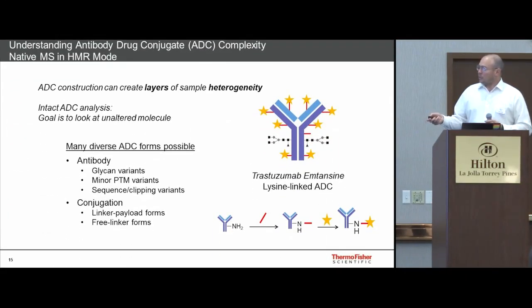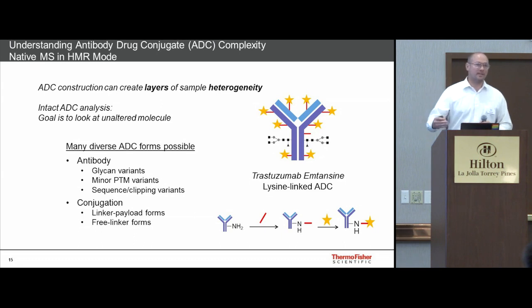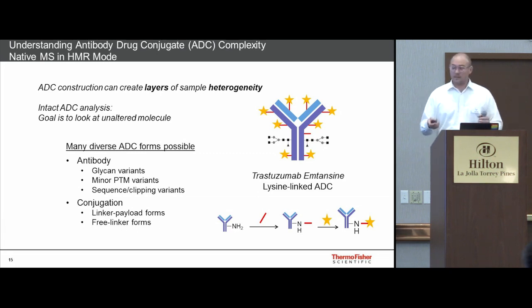When we get into ADCs, now this is another ball of wax altogether. So ADC construction makes a complex mixture that is an antibody. It makes it even more complex. It's nearly over the top. And we found that the denaturing approach really wasn't suitable for this, to get the right answer consistently.